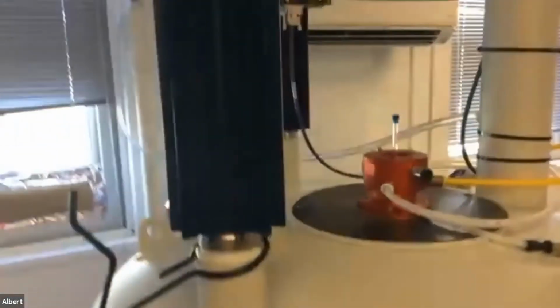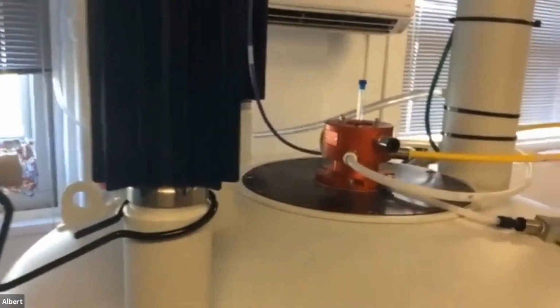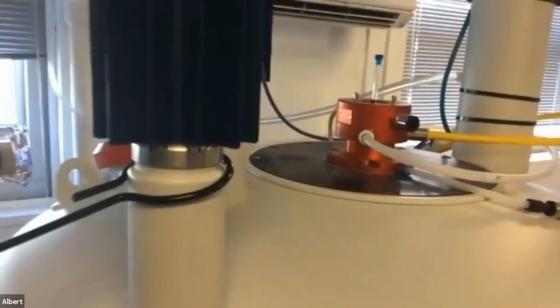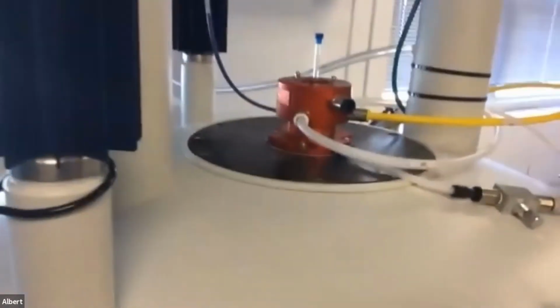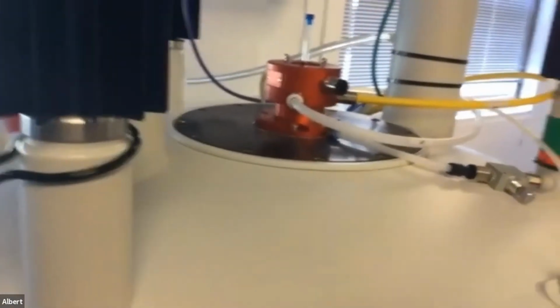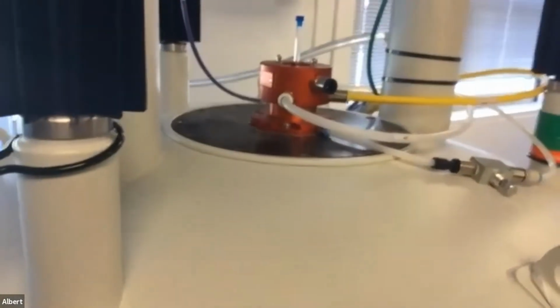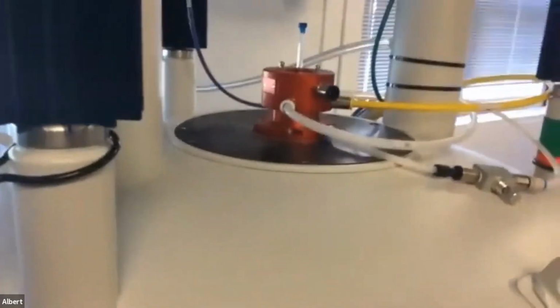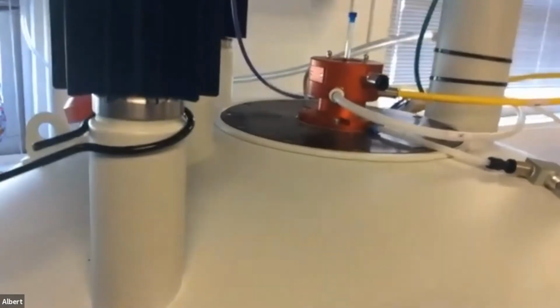What you'll end up doing, the sample will end up dropping all the way to the bottom of the instrument, breaking. Then you got to take it apart, take the probe out, and disassemble everything and clean everything and get the glass out. And if you have to call the company for that, they charge you from the time they get in the car to drive to the airport. That's when that hourly rate starts. So for them to fly here, fix this, clean it, and go back, it's about 50 grand. So you don't want to just be willy-nilly over here because this stuff is not cheap.